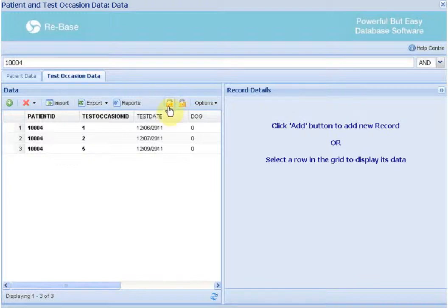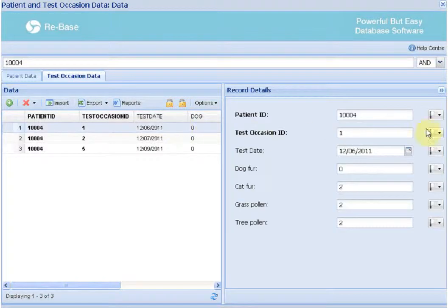Records can be locked or unlocked, and certain data values can be flagged. To see these features in action, imagine a scenario where an administrator of a view had employed a data entry clerk to input all her records. After the data had been entered, the administrator wanted to check if it had been entered correctly. If whilst checking the data she realised certain fields were not entered correctly, she could set a flag next to these fields, which would act as an alert to the data entry clerk.